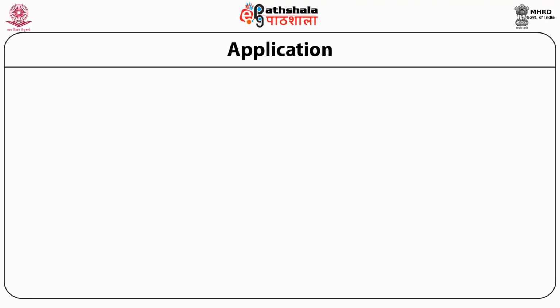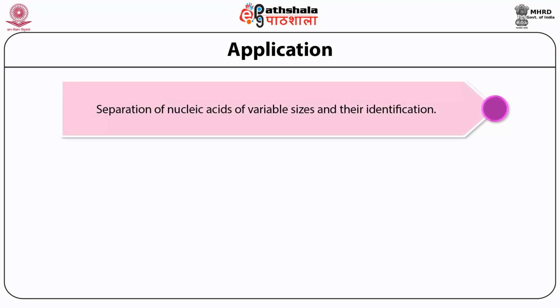Agarose gel electrophoresis is a separation technique, and this technique has wide use in molecular biology research. I will be explaining some of the applications where agarose gel electrophoresis can be performed. As I said a number of times, agarose gel electrophoresis is a technique for separation of nucleic acids.